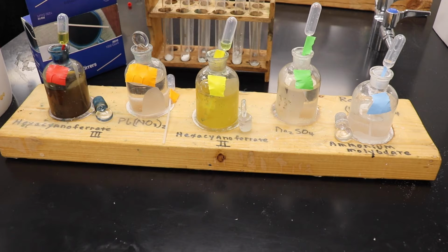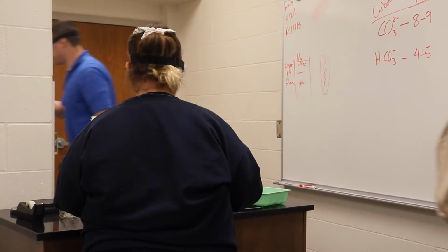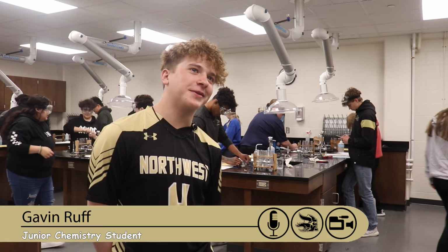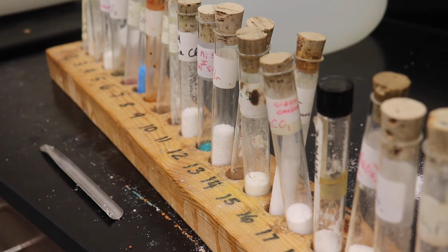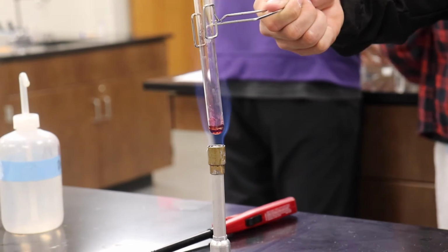When they've done that, they'll come check with me and see how well they conducted their tests and how well their reasoning led them to whatever answer they came to. You get some chemicals and you mix it with like compounds and stuff and try to get something like a color or a smoke or something. The process is just a giant process of elimination.